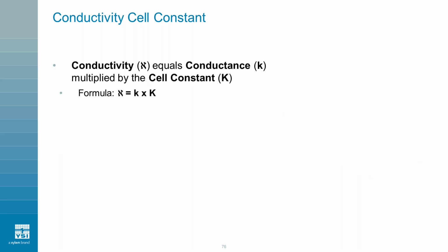So now that we know how our cell constant is determined, we can apply it to determine our conductivity value. To ensure conductivity cells of different shapes and sizes can generate comparable data, sensors multiply the conductance by their cell constant. This results in the conductivity value.